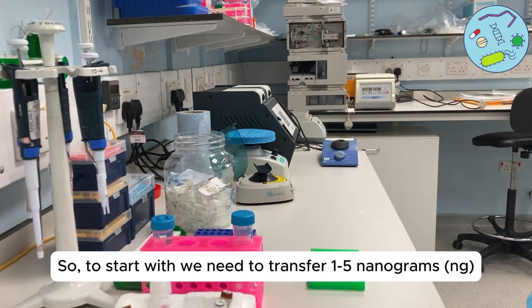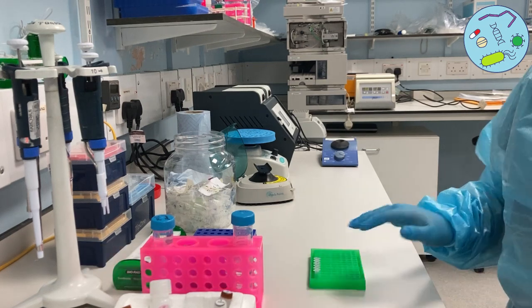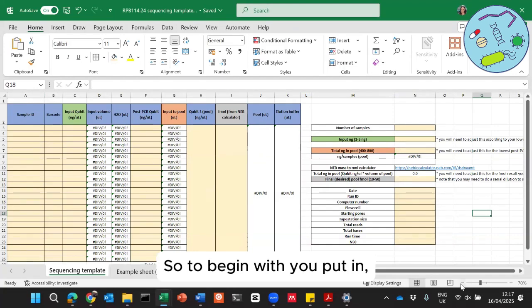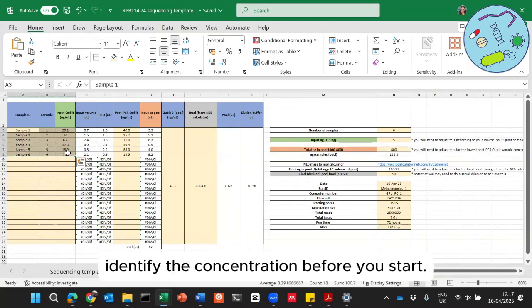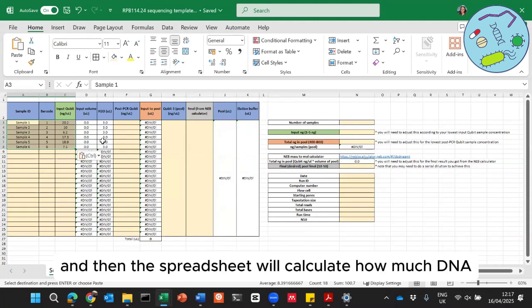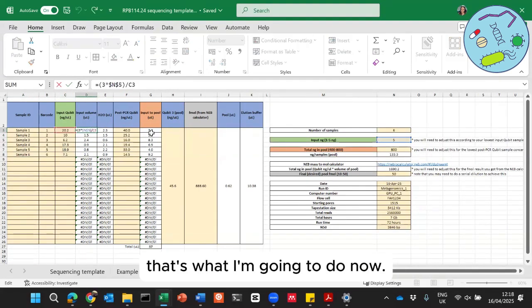To start with, we need to transfer one to five nanograms of DNA into a tube and adjust the volume to three microliters with water. I've prepared an Excel template spreadsheet so you can input all of this information. You need to input information into all of the yellow boxes: sample ID, the Qubit concentration — you need to identify the concentration before you start — and also the barcode numbers. The spreadsheet will then calculate how much DNA and how much water you need to add to normalise them.